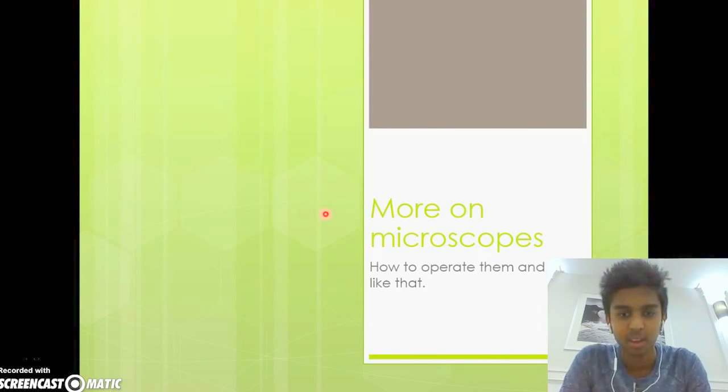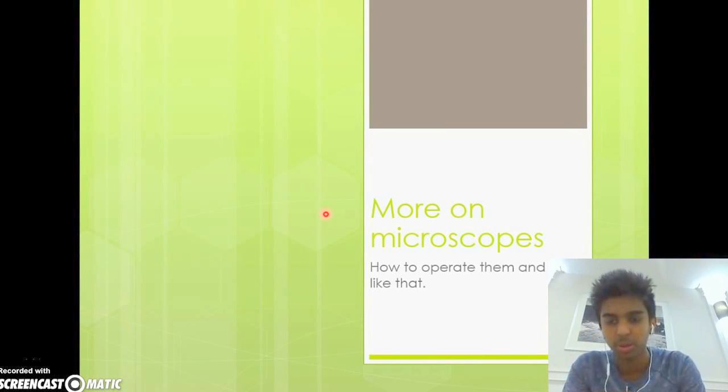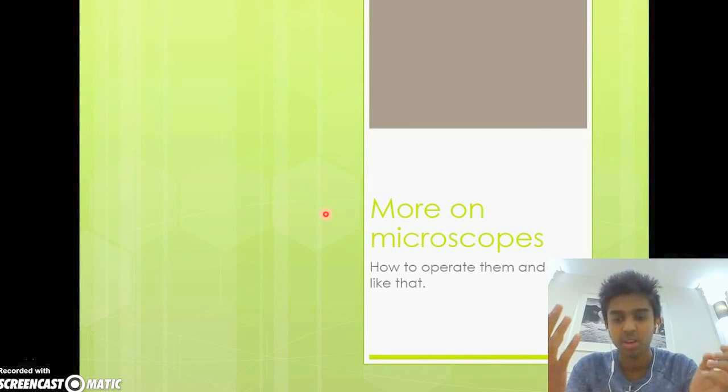Hey, so welcome back to the easiest briefing of them all: the basics of the microscope. It's going to cover the parts of a microscope, how to operate the microscope, and what a microscope actually does. It's really easy.